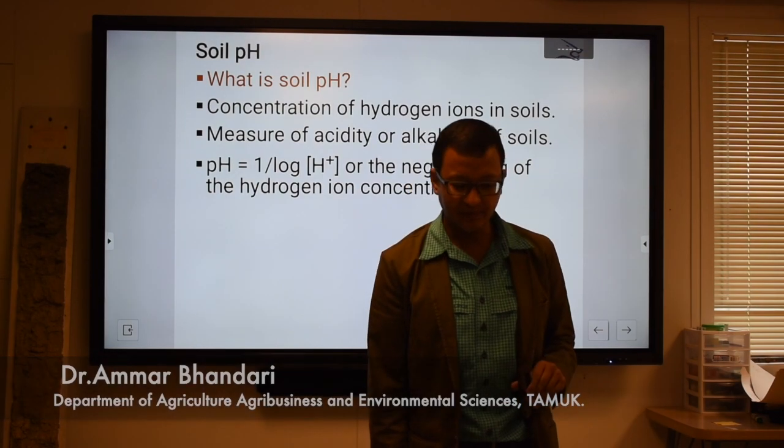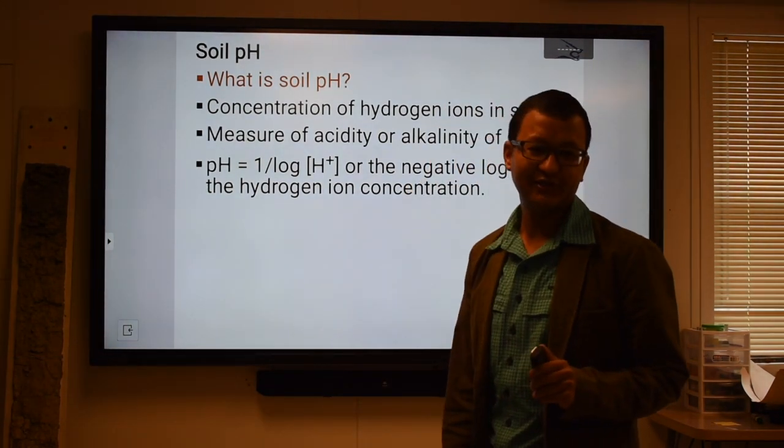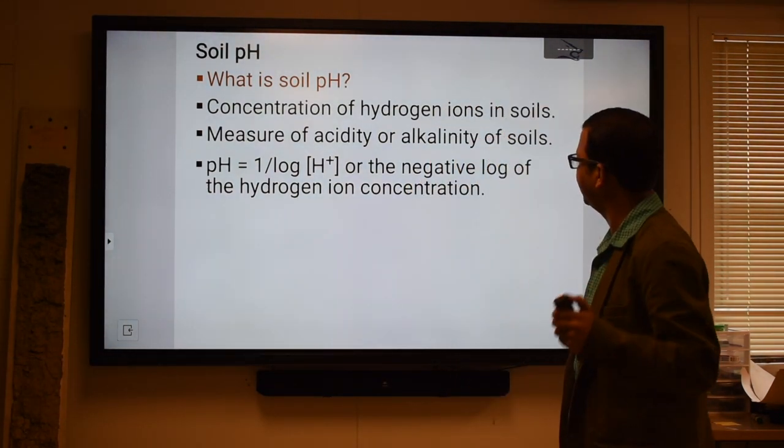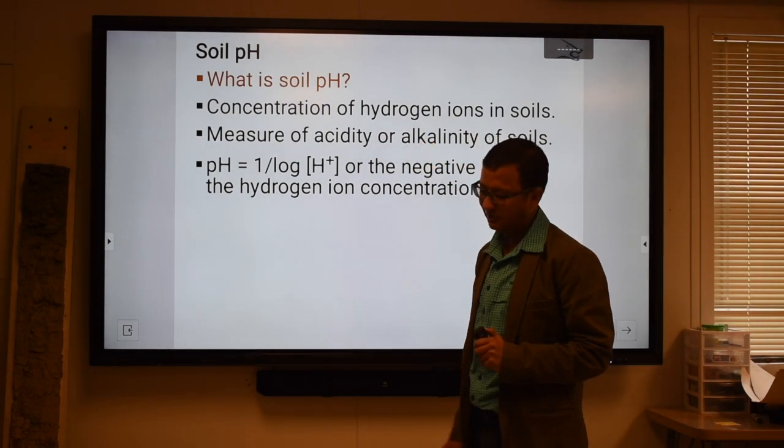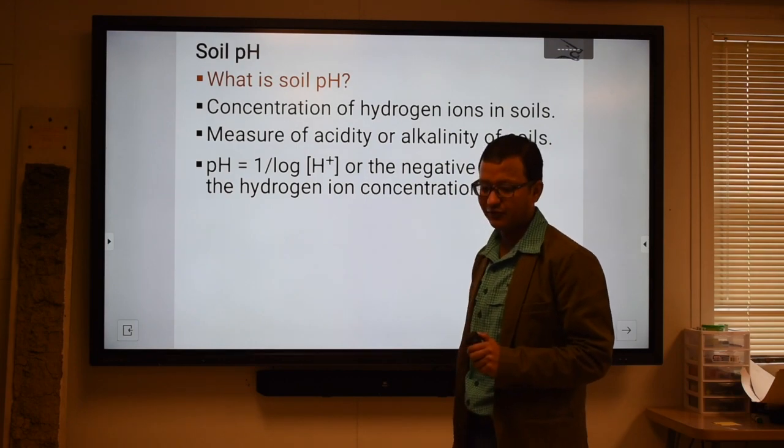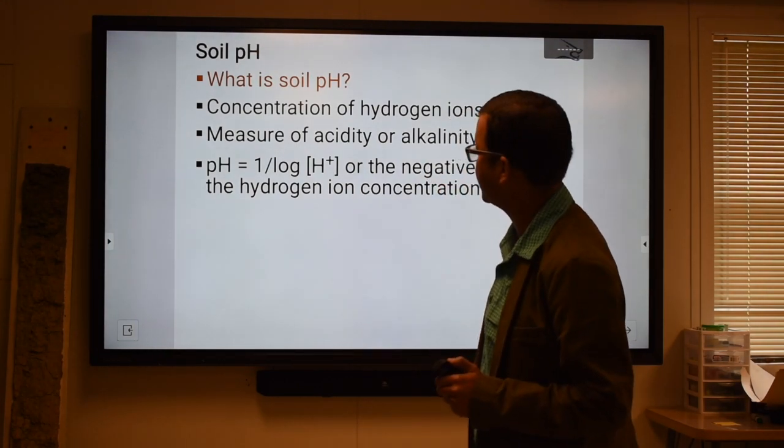This week we will be discussing soil pH for the lab part. I have Sri here with me as well. We have discussed this in the lecture class, but I'll briefly go over soil pH and how we measure that in the lab.